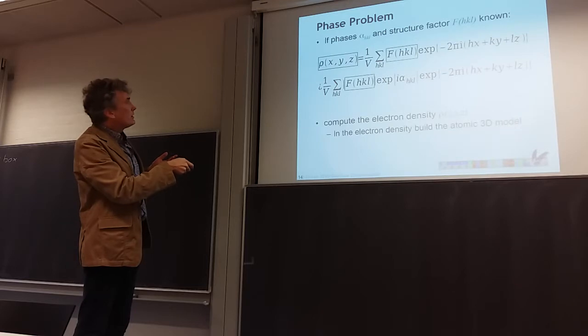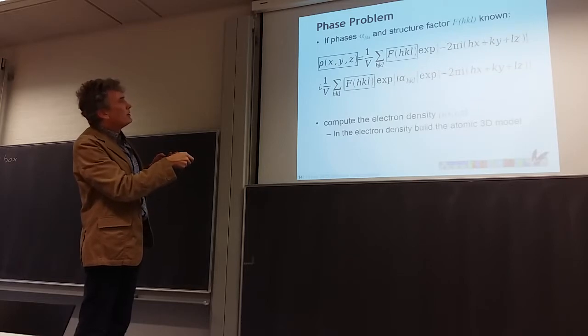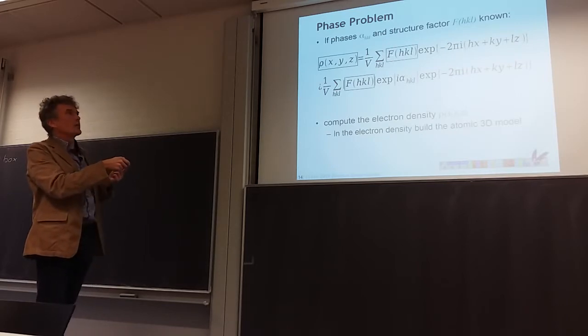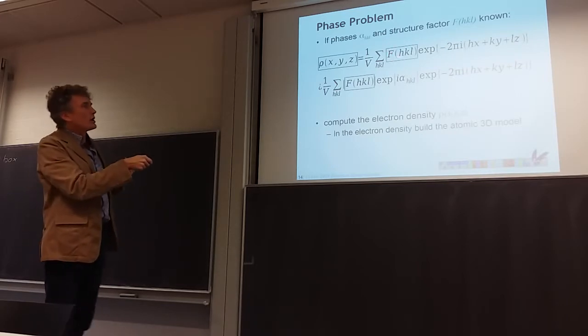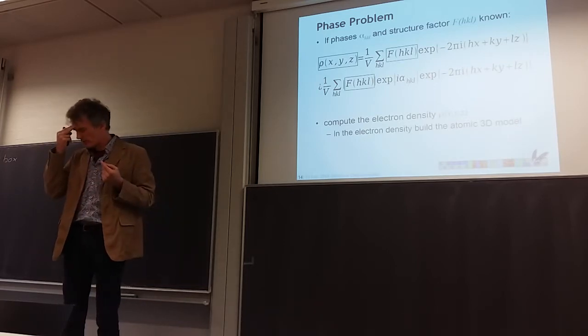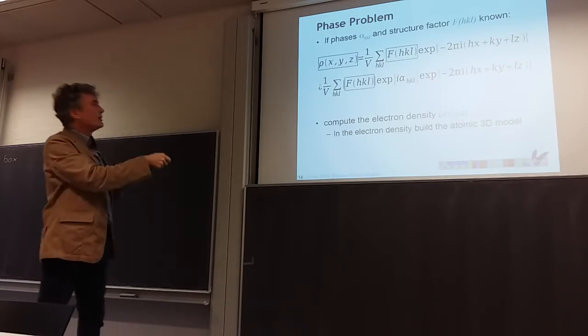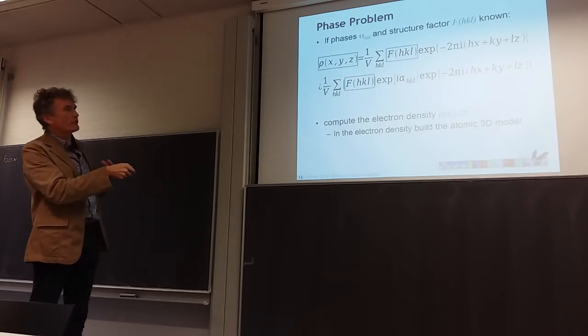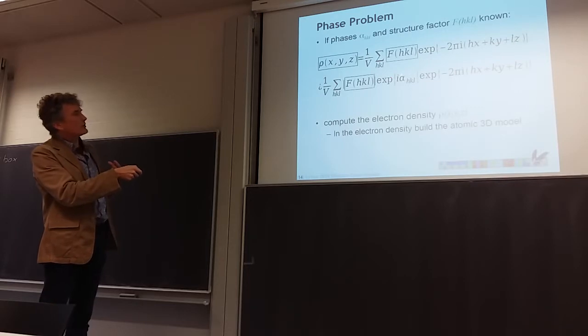And there should be an equal sign, I think. There's two versions of this, but this is how most people write it down. But then the f is actually a, looking for the word, starts with a C. Yes, a complex number. If you write that out into two components, you get the actual f's that we've measured, and the alphas, which is another component. And they're called the phases.